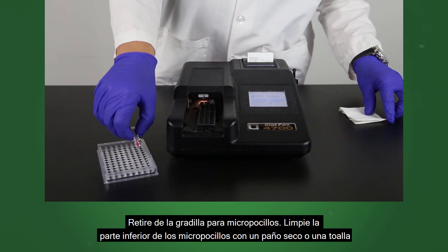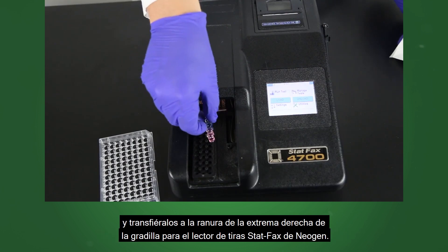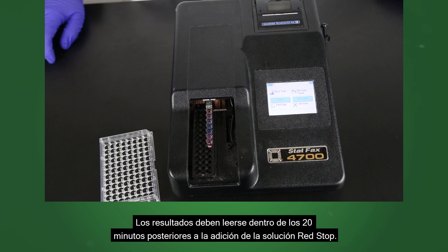Remove from the well holder. Wipe the bottom of the microwells with a dry cloth or towel and transfer to the far right slot of the tray holder for the Neogen StatFax microwell strip reader. Results should be read within 20 minutes after the addition of red stop solution.